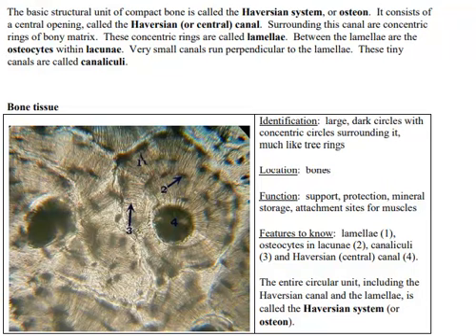But the outside of all of the bones has a very hard layer. And when you slice through these hard layers and look at it under the microscope, you're going to see certain features. In this particular picture, in this microscope slide, you see this hole in the middle, and that's known as the Haversian canal or the central canal.